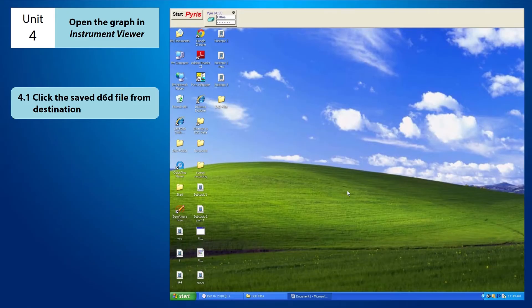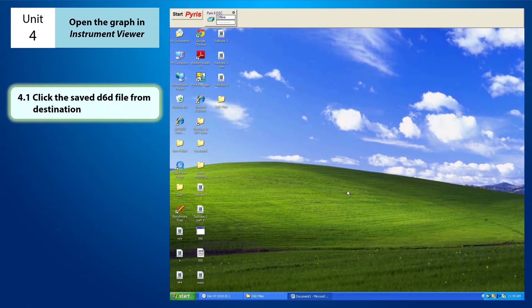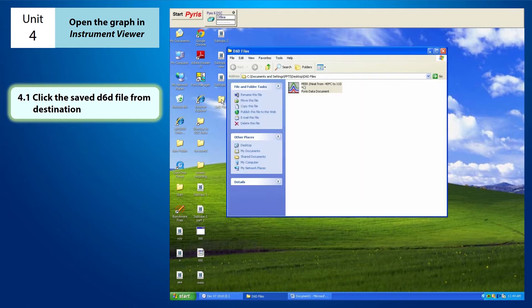Hi everyone, this is a tutorial video on how to open the graph on the instrument viewer. In order to open the graph, you need to click on the D6D file that you had saved previously. For instance, I already saved my file in the D6D folder on the desktop.